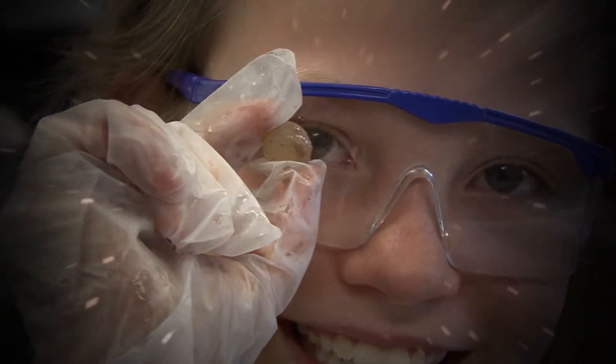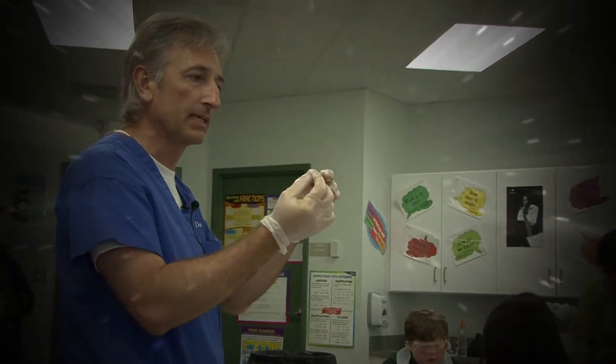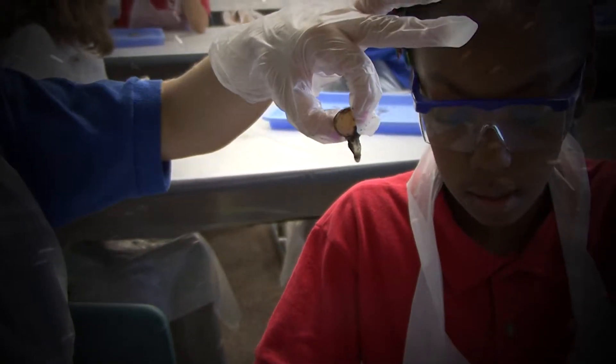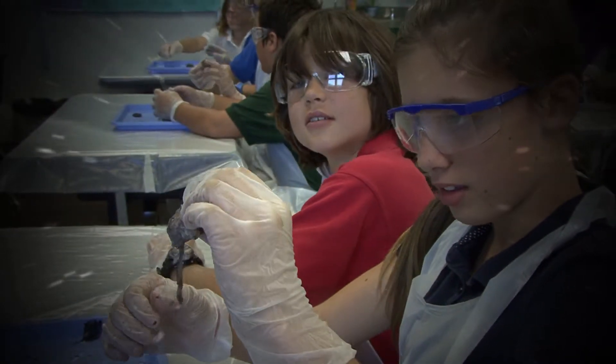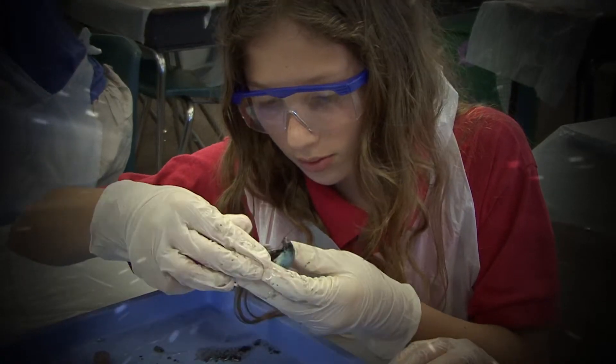The lens has some gooey stuff attached to it, and there's a special little muscle called the ciliary body that does the focusing of the lens. You can pull that off if you want to get a better look at the lens — just clean off the gooey stuff. The black stuff in there is part of the retina, and the retina is actually a layer of cells coating the back part of the eye.